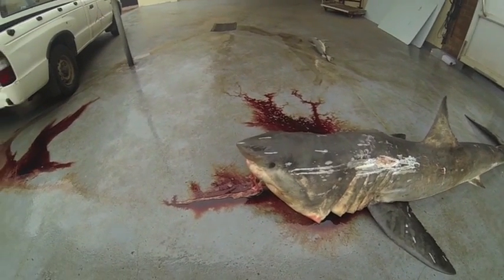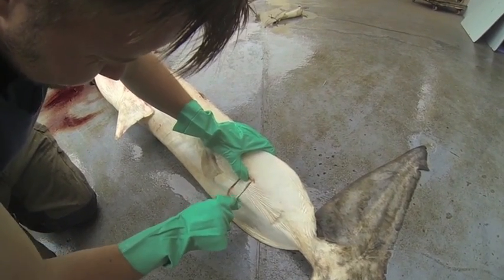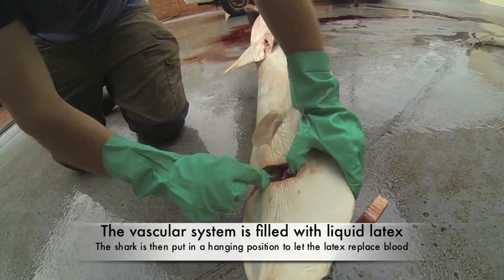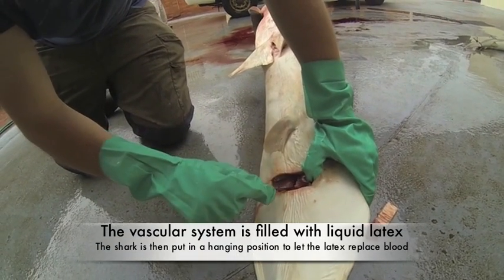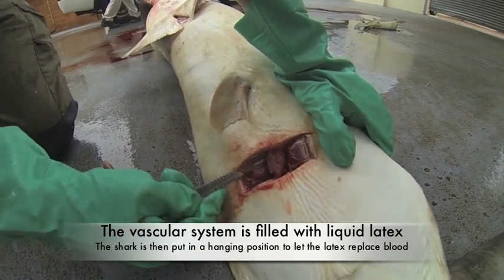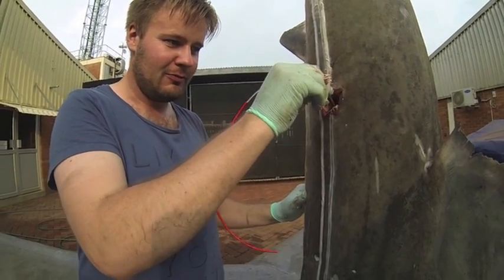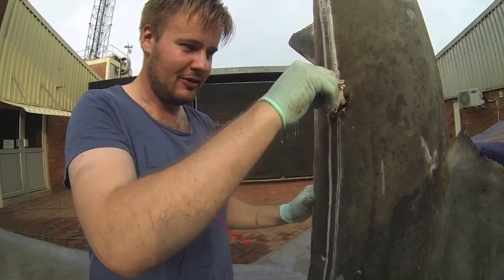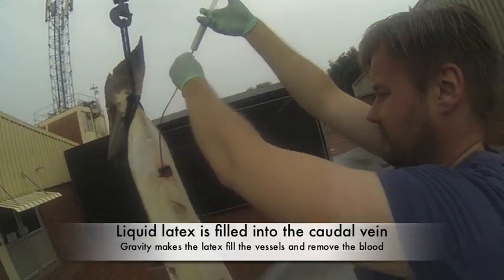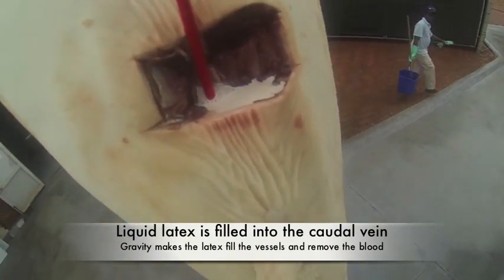By putting liquid latex into the blood system, it's much easier to dissect the shark and see how the system is arranged. Here we expose the caudal vein to inject liquid latex into the shark. We use different techniques to fill the blood system — here we can see a shark hanging while we inject the liquid latex.